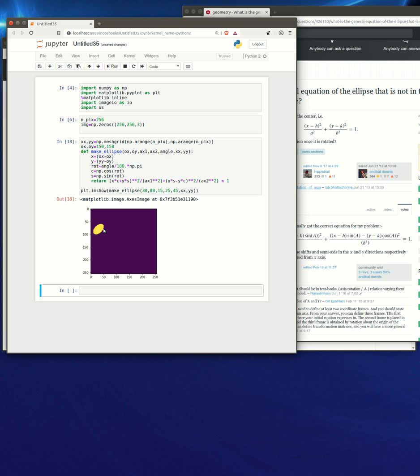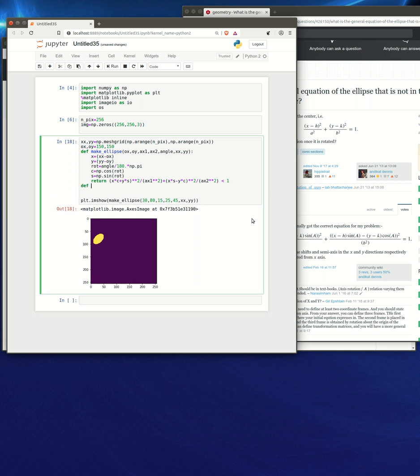So this is great. Now we have the choice how to color these ellipses, and I'll get into how the coloring works in a minute. What we can also decide is whether to have overlapping or not overlapping cells in the image. So the way we could do this is to say, if we make many cells and we want to do this randomly now, we can just say we take the original image and we want to put n cells inside.